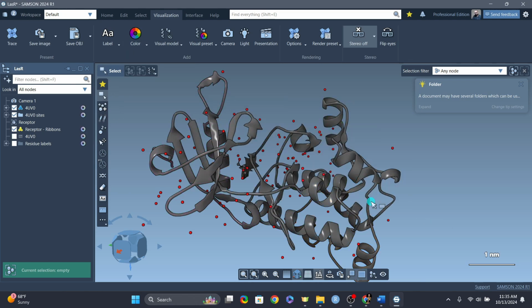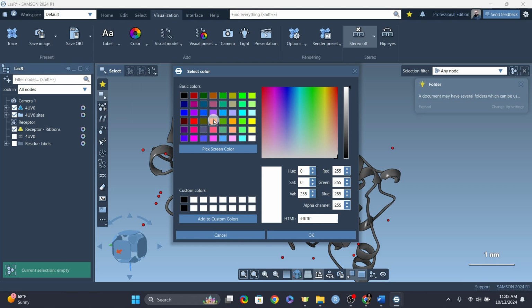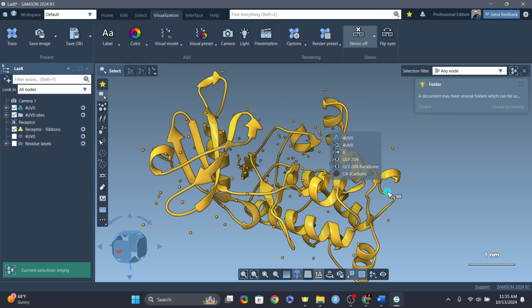Look at this. So it's going to change based on the backbone. It got changed, right? Constant illustrative. Okay, so you can also provide a specific color to this. I don't know, let's use this, and yeah, you can actually see that has been applied, but there is no effect on these shadows and all, which looks good, right?